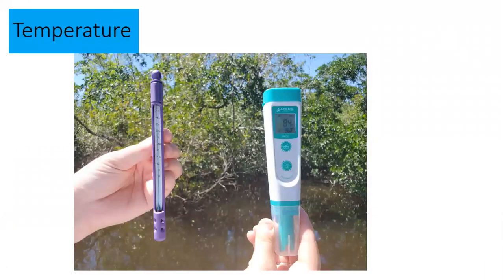Now our next measurement is temperature, and this does tie into that water depth because if your water is shallower, it's going to heat up quicker by the sun's rays. And when we are looking at our temperature, we can use a few different tools. We have a regular thermometer here and then also a digital probe that's looking at the temperature. A lot of times when we're checking the temperature in our house to see how hot it is outside, if we wear a sweater or a t-shirt, we're going to look at Fahrenheit. But since we are collecting scientific data that we want to share with other countries, we are going to use degrees Celsius.